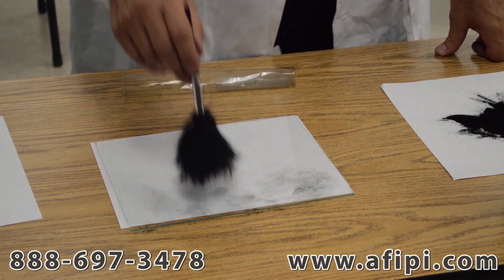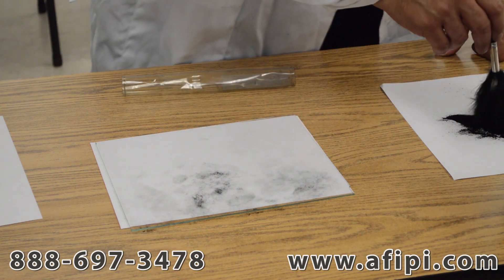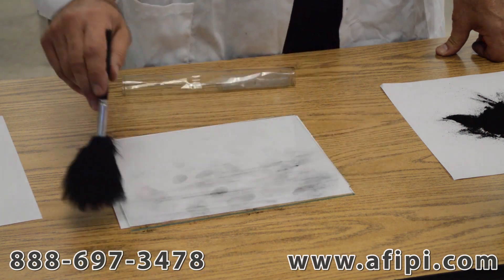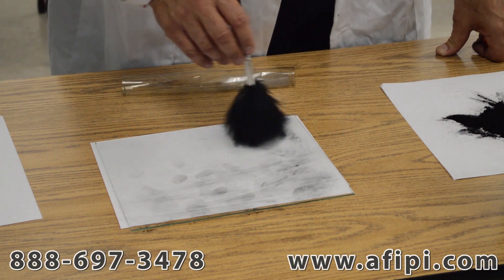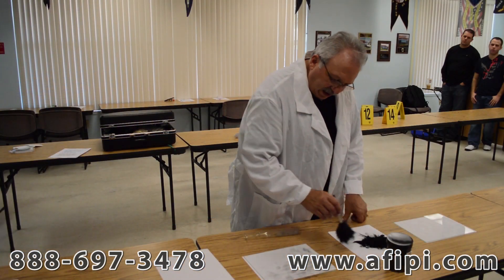Another way is dabbing. Dabbing leaves a little bit more powder on the surface, but you can take that off with a gentle breaststroke of painting. And then last, here's what you see on CSI all the time — and that's the twirling. This is also an effective method for enhancing latent fingerprints.